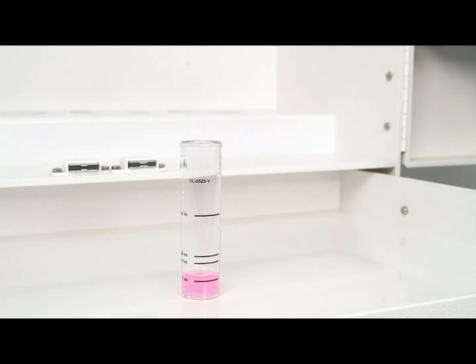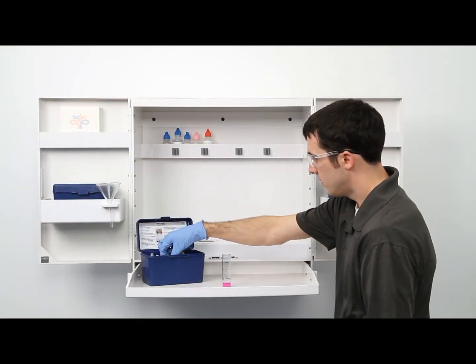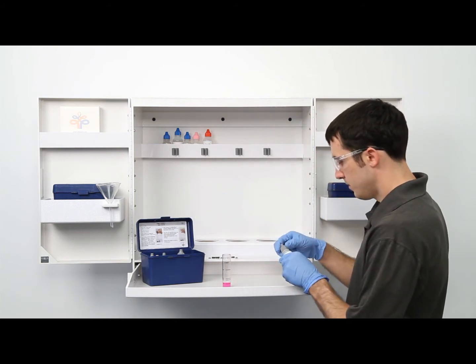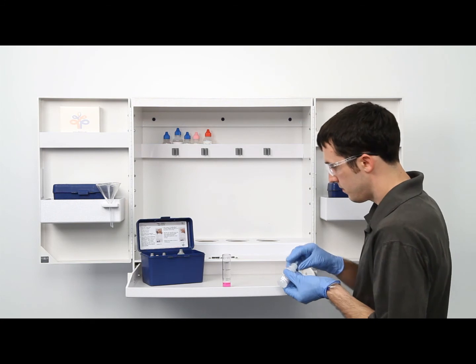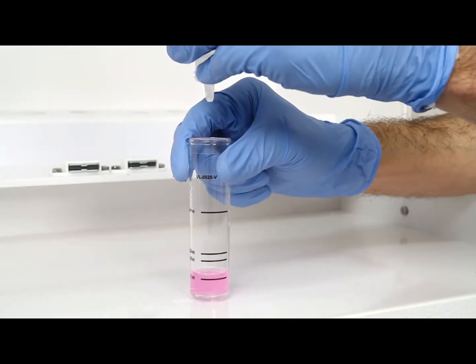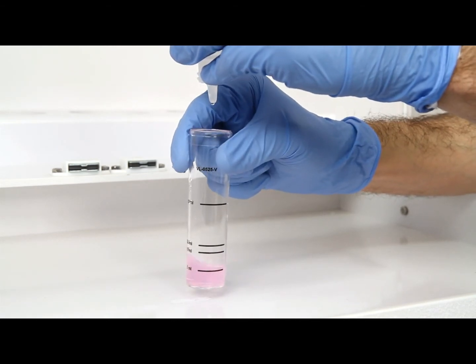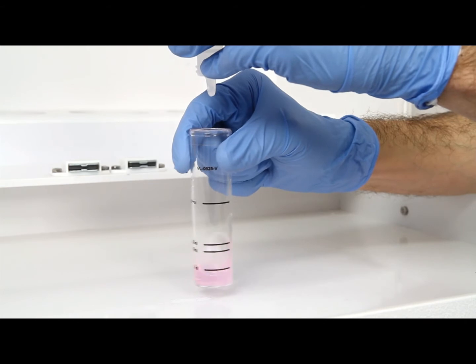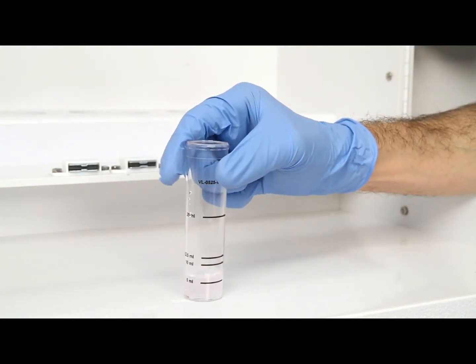If the sample turns a pink-red color, you must add sulfuric acid 0.5 normal 1 drop at a time while swirling until the sample turns colorless. If the sample stays colorless after the addition of the phenolphthalein indicator, you can skip the addition of the sulfuric acid 0.5 normal.